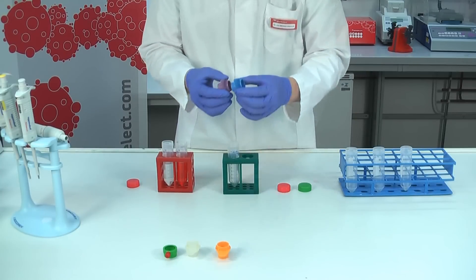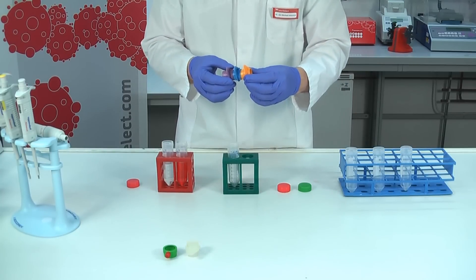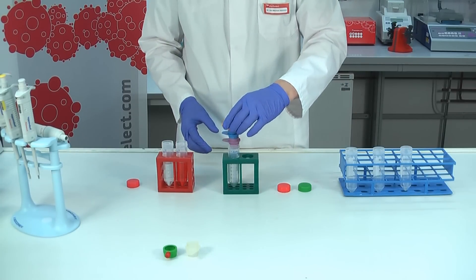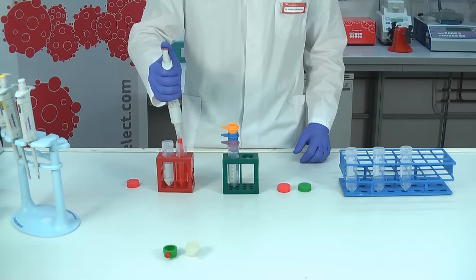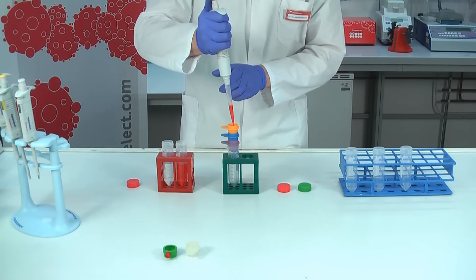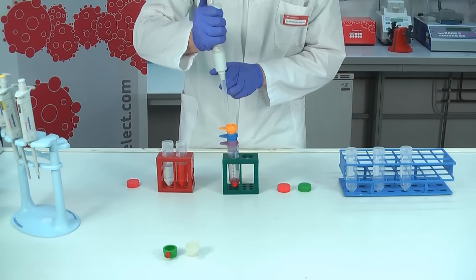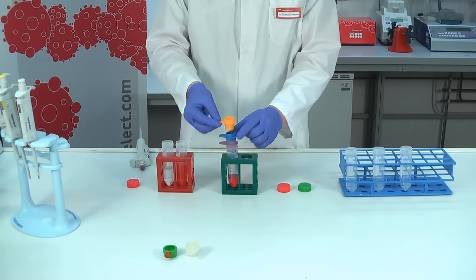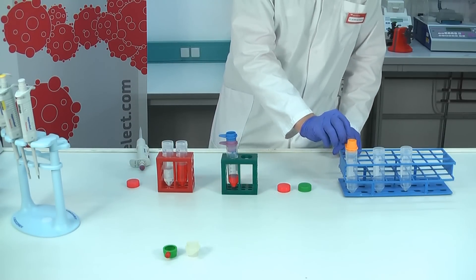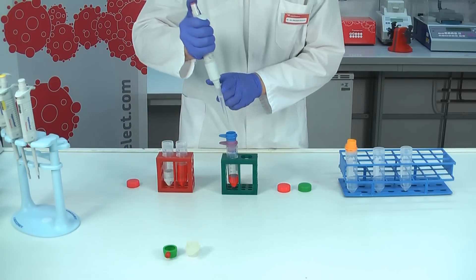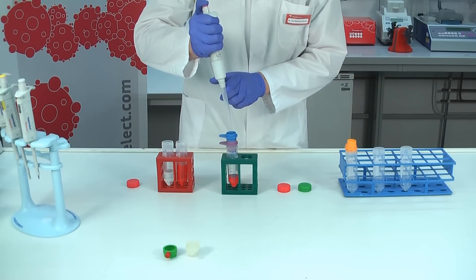It is also possible to stack various pluriStrainers together. This way you can sieve different sizes. Add your sample material on top and then wash sufficiently with wash buffer. When everything has run through, remove the pluriStrainer on top and put it upside down on a fresh tube. Repeat this step for each strainer.